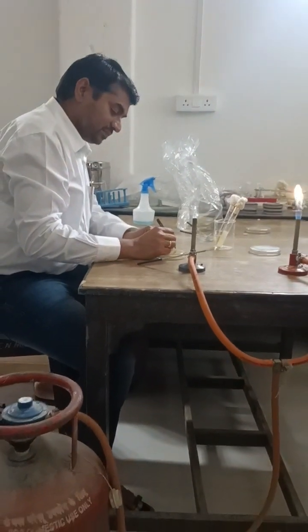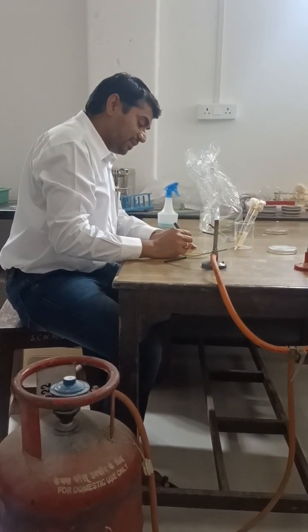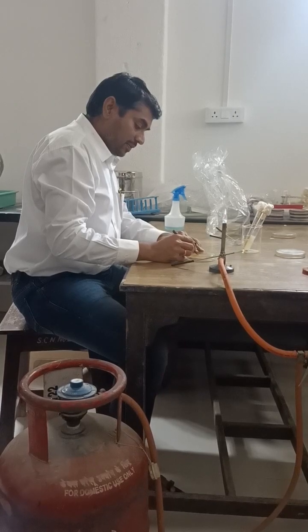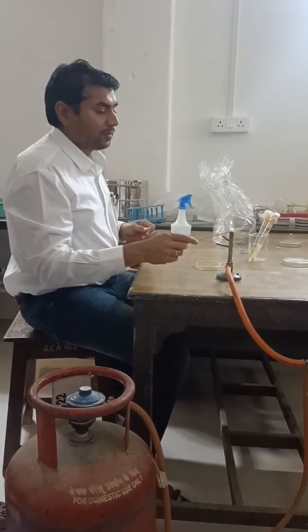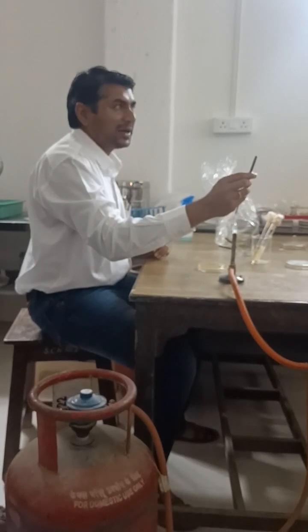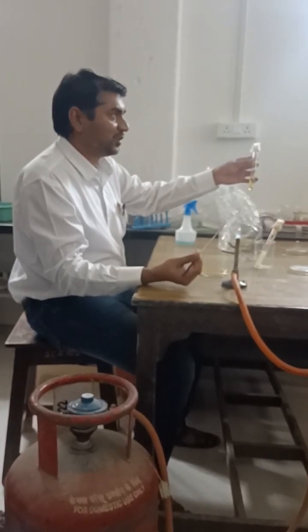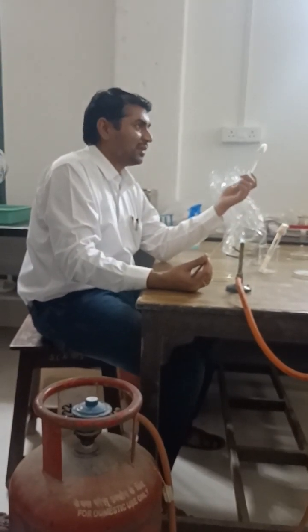Today we are going to discuss the spread plate method. This is done on solid nutrient medium present in a petri plate. First we label the petri plate, mentioning the date and name of the sample to be spread. For transfer, we use a calibrated wire loop — calibrated to 10 microliters — purchased from HiMedia. We are going to transfer a diluted sample, already diluted by serial dilution in nutrient broth.